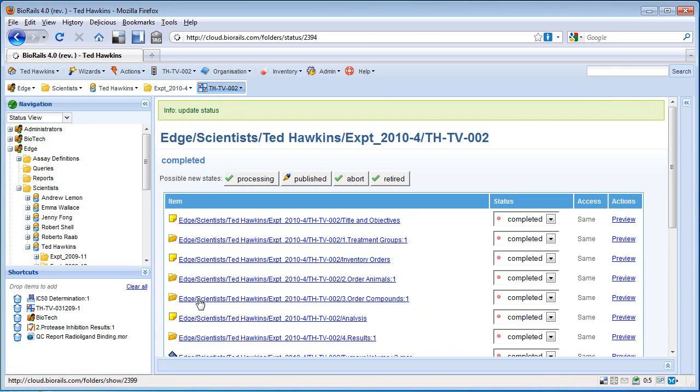That's the tumour volume experiment complete. If you'd like more information, please contact us at the Edge Software Consultancy. I look forward to hearing from you.